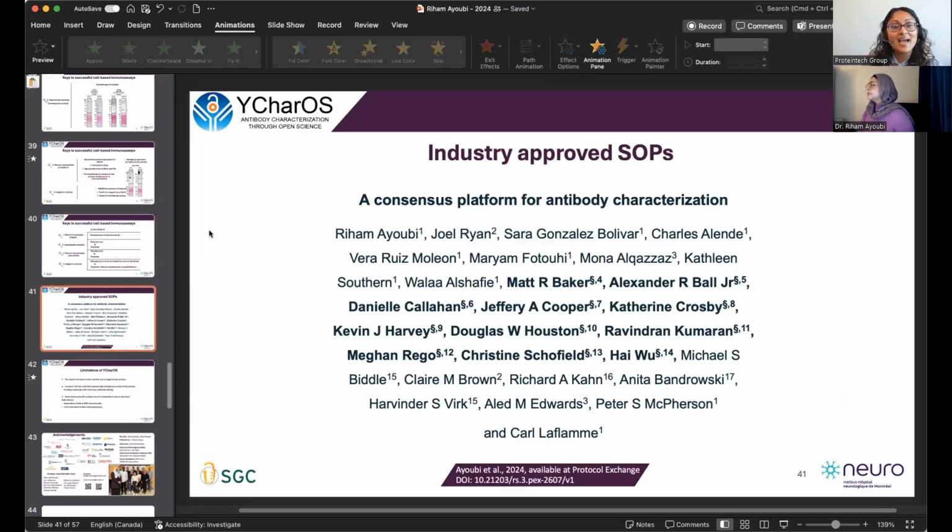Great. The next question is asking, so when validating antibody for immunofluorescence, you discarded secreted proteins. Why is that?